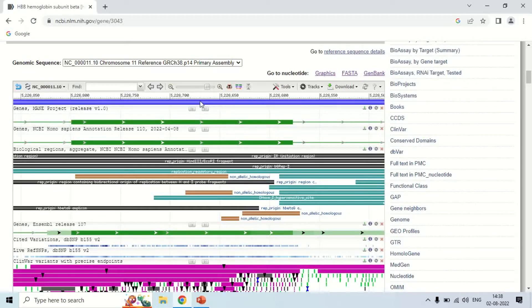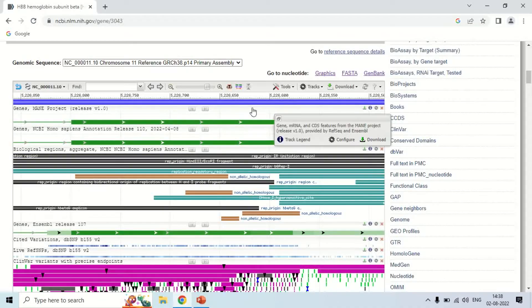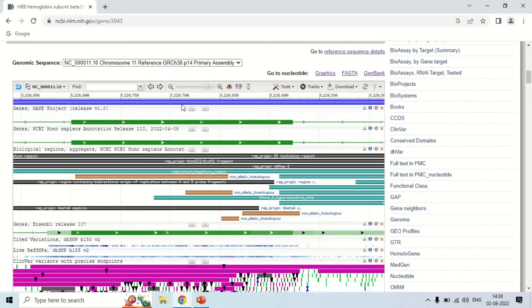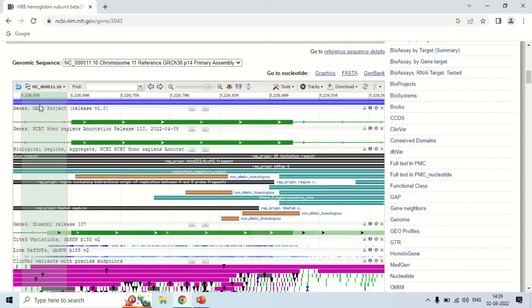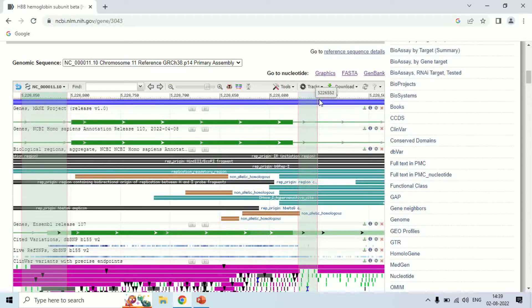Now, to design the primer so that this second exon can be amplified, you select the portion according to which you want to make the primer. Click and drag the sequence to select the region — this will be our forward primer region. Since there are two primers in PCR, press the Control key on your keyboard and select another portion for the reverse primer. Now you can see that these two portions are selected.